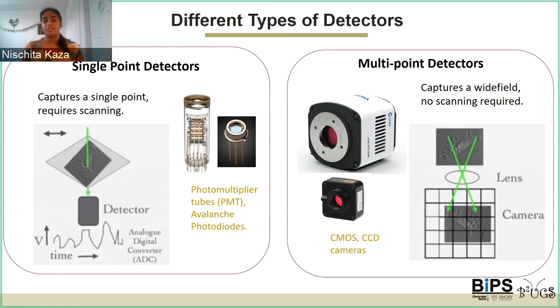Another really important consideration would also be the sizes of the elements in the camera, or the pixel sizes, and how you would sample this. This is something we'll get into in more detail in the next session, but just remember that that's something you want to consider.